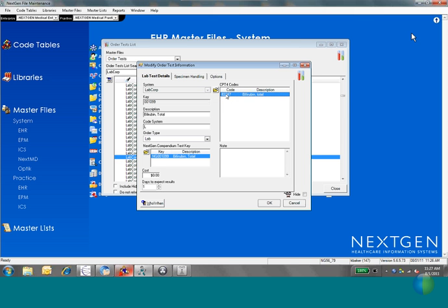So all you have to do is a one-to-one match on the CPT code for each test. And again, that's mostly a manual process. When we get to the orders management console at the end, I will show you a way that might work for you to download it from there, but it won't work for everybody.